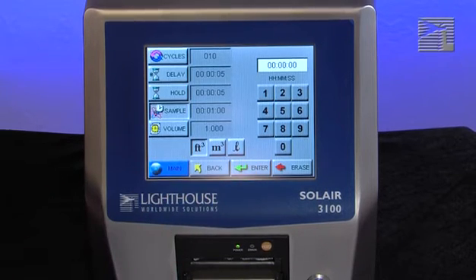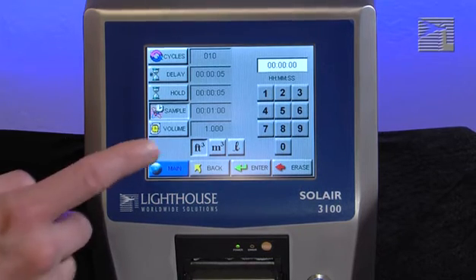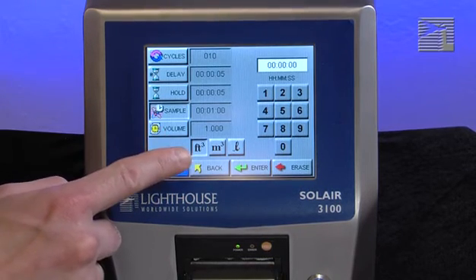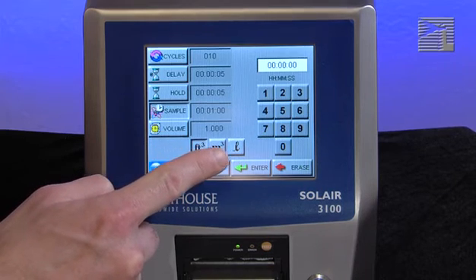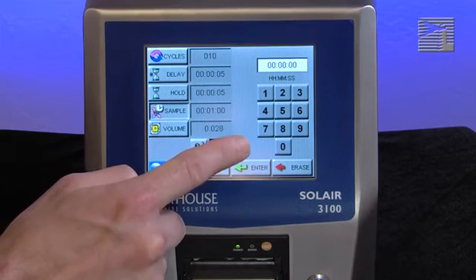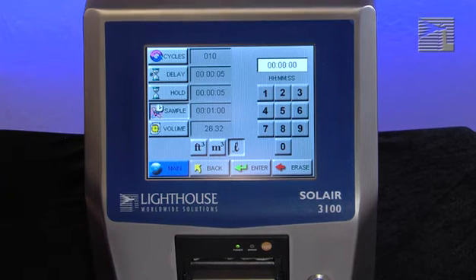Instead of selecting a specific sample time, the instrument can be set to measure a specific sample volume in cubic feet, cubic meters, or liters. When this is set, the corresponding sample time will automatically be configured.